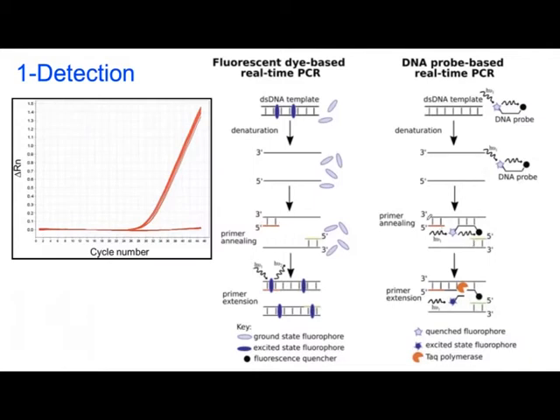Again, you design the same primers, left and right, but you also design a probe that specifically binds and gives you the answer. And this probe, as I mentioned, is going to be broken down. Whenever the fluorescence increases, it means yes, this is a positive sample. If there is no fluorescence increase, you say no. You can easily tell from this curve which is a positive sample. And you can tell the software, by looking at a certain CT value, and I'm going to talk about CT value later on, that if the CT is below 24 it is positive, and above 24 is negative. So you can tell the machine, and the machine can give you a report immediately within 40 minutes. So that's one of the applications.